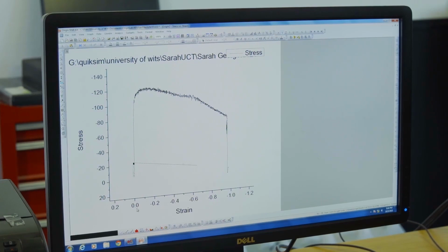But if you really want to achieve 1.00, you need to repeat the experiment and tweak your parameters a bit. Like I said, the negative sign you're seeing here is just indicating that we're carrying out compression. But you can always convert this to positive.